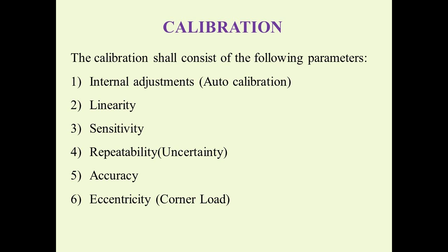Press the key Cal given on the front panel of the balance until the display of Cal int is displayed. Release the key. The instrument performs calibration automatically. Wait till the message Cal done is displayed and take the printout if the printer is attached.